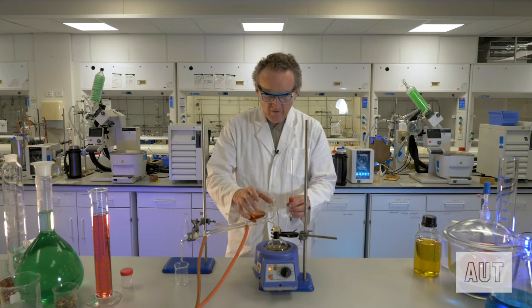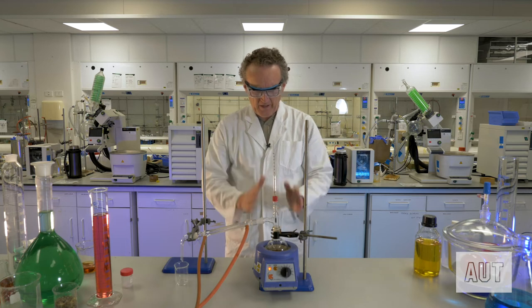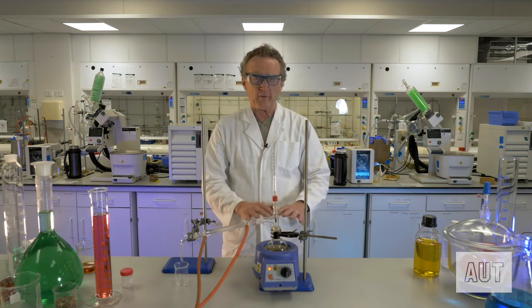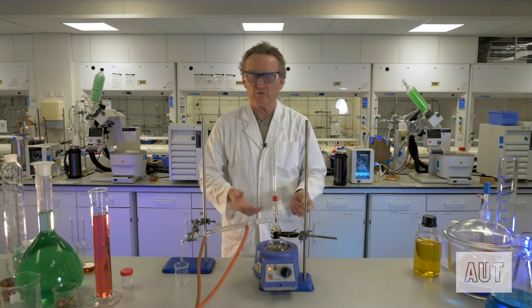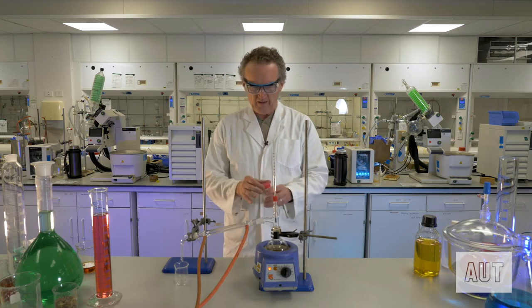Okay. So there we go. Now, one thing, it's tempting to overfill the round bottom flask. Don't fill it any more than, say, around about half full. If you've got more, do it in two stages or two batches. Don't try and get it all done at once because it might start boiling over. So be careful with that.